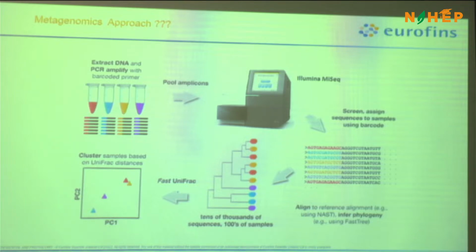For example, metagenomics can be done in different ways, that is shotgun metagenomics and amplicon-based metagenomics. When we say amplicon-based metagenomics, that comes under 16S and ITS. There are specific markers which can be used for a specific type of microorganism which we are trying to detect.